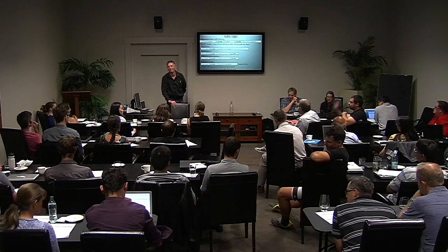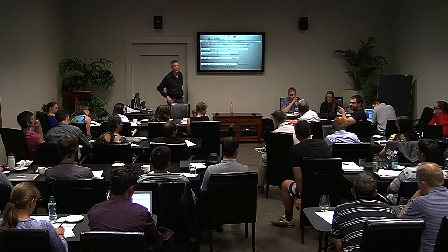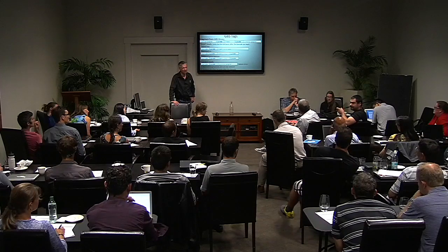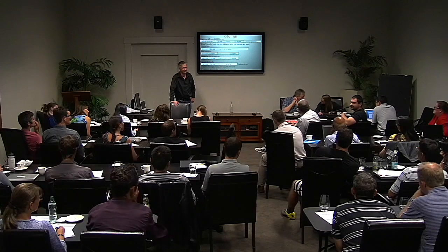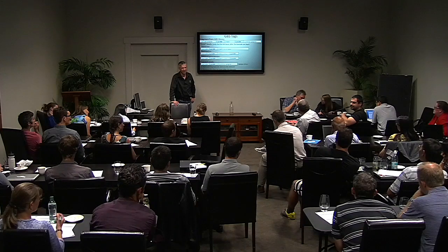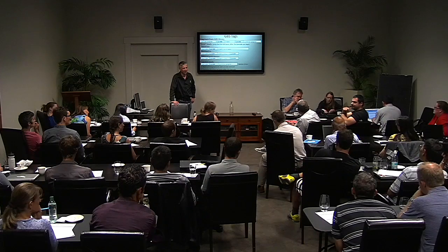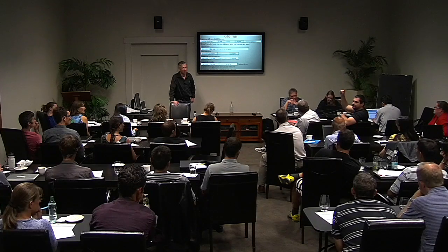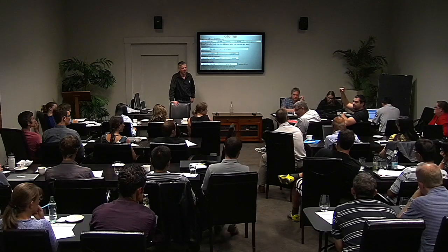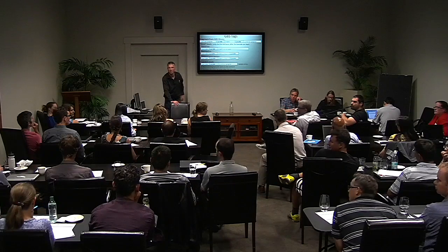There you go. I was going to say something else. This is very similar to the design of the k-mer size that we need for assembly, and it varies by species. So if you grab a couple of the available genomes and map next generation sequencing data on them using different k-mers, you'll see that the change from very, very short k-mers mapping everywhere to suddenly becoming unique as you go to longer k-mers is actually very quick, and it varies by species, so you can determine that pretty easily.